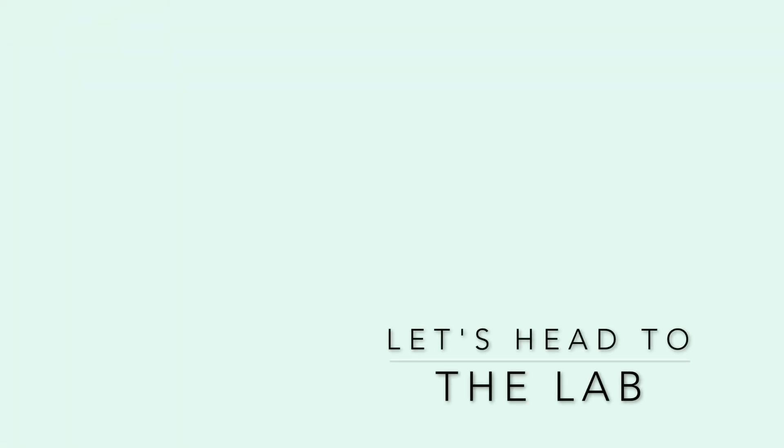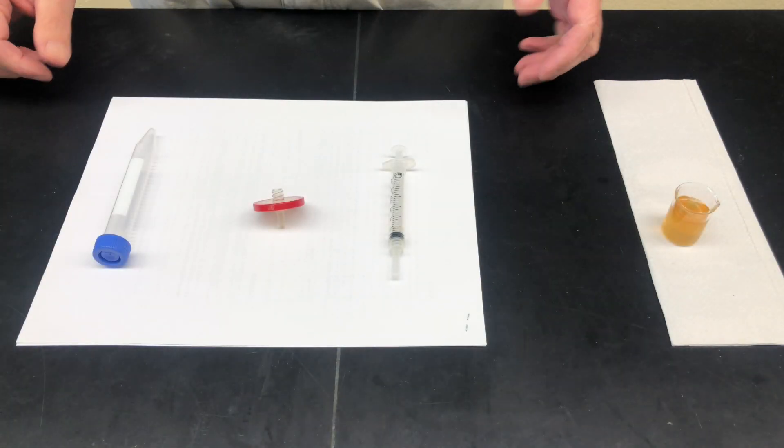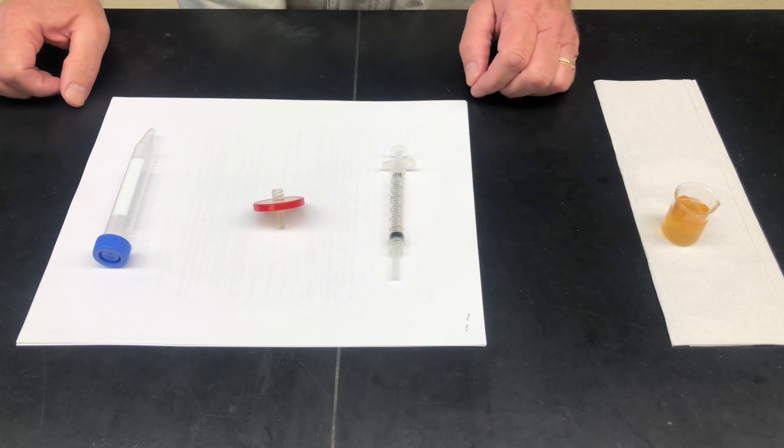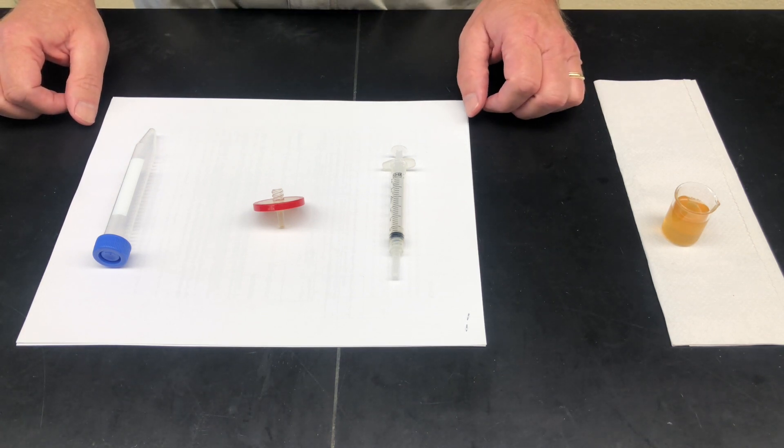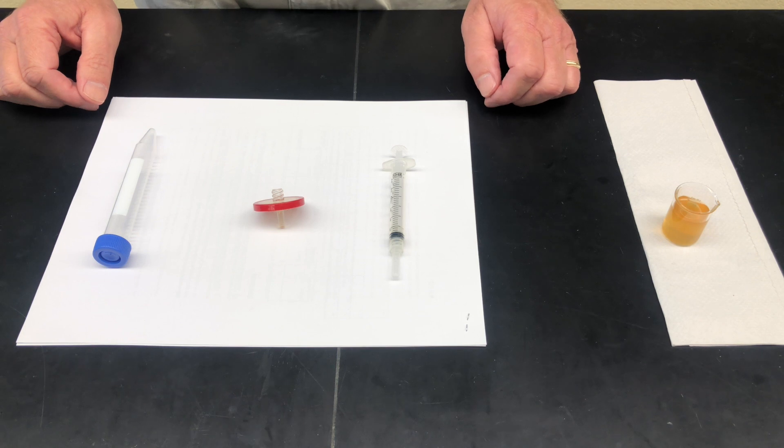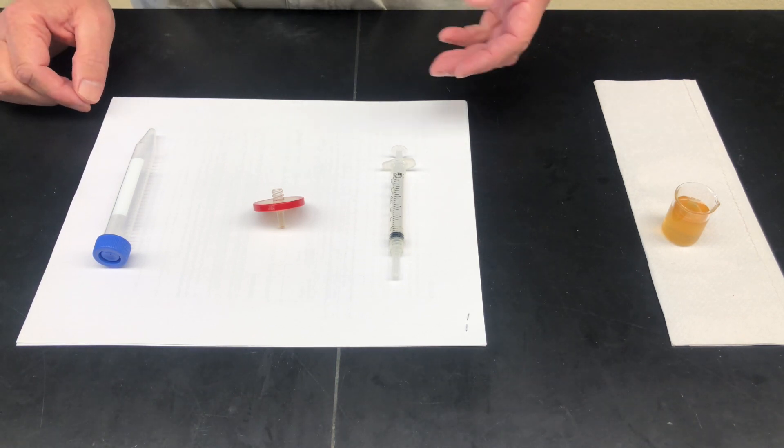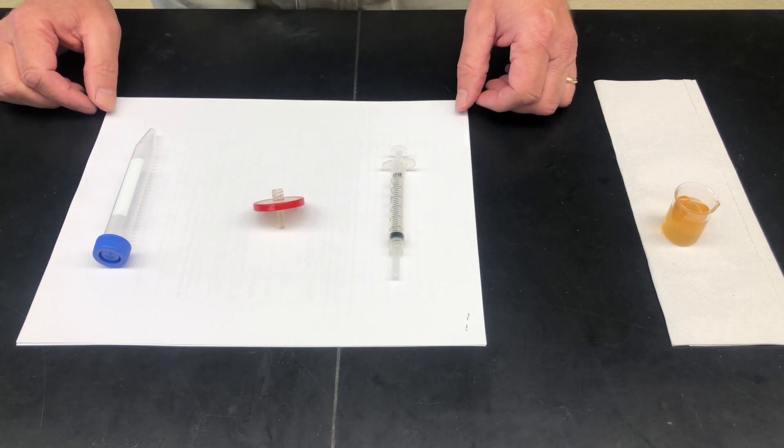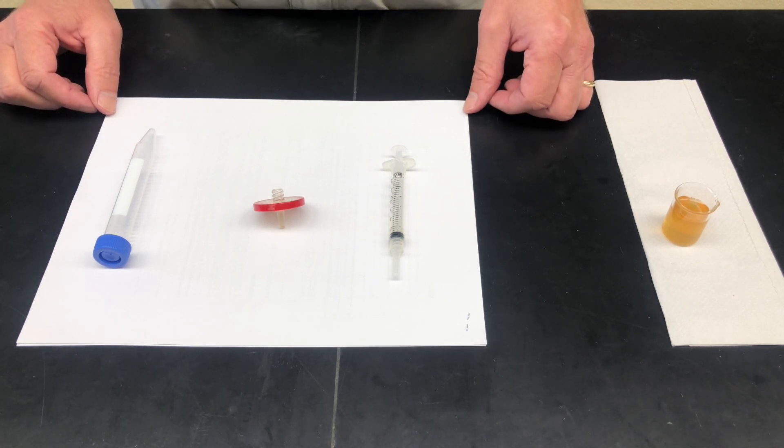The next part of this video is a simple demonstration of the parts available in the kit as you would receive it, and also a demonstration of how the kit would be used to prepare a kombucha sample for shipment to us at Cultured Analysis. What we're doing here is introducing you to the filtration kit so that you can cheaply and inexpensively send samples back to us for analysis. First, I want to introduce you to the various parts of the kit as you would receive them.